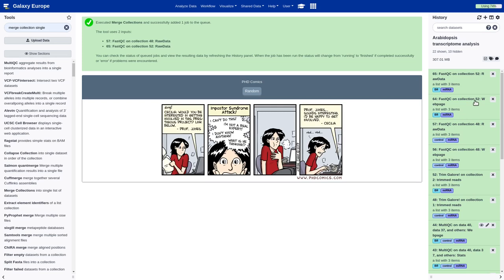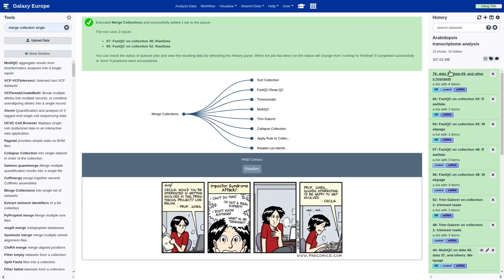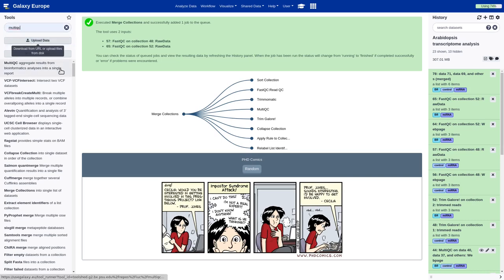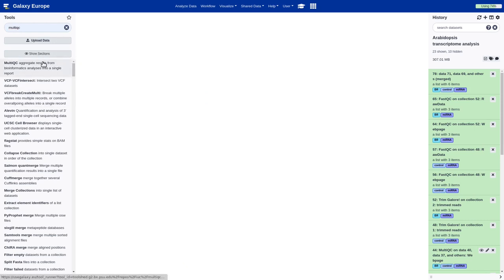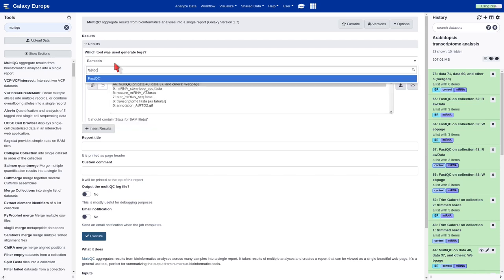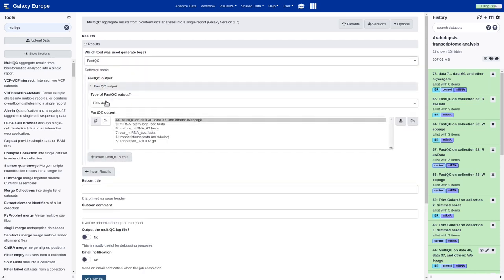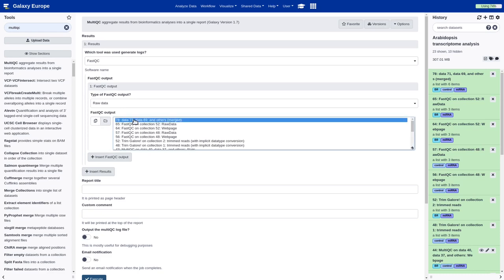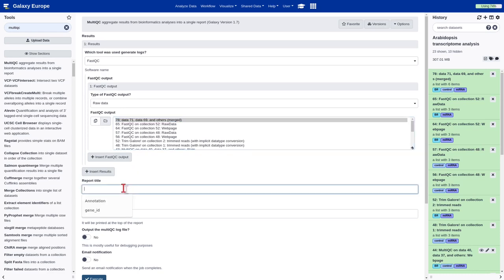Once we get the merged collection, we should once again use the MultiQC tool in order to generate the report. We are going to add the merged collection and provide a report title, for example, Post Processing Quality Assessment, and execute.